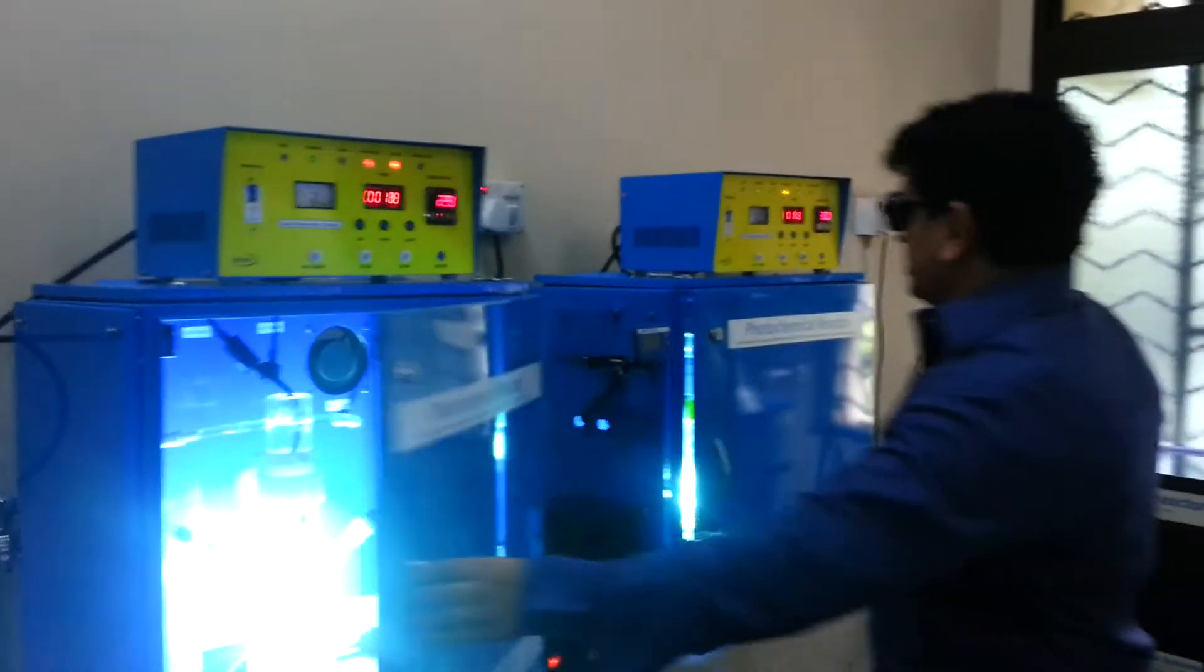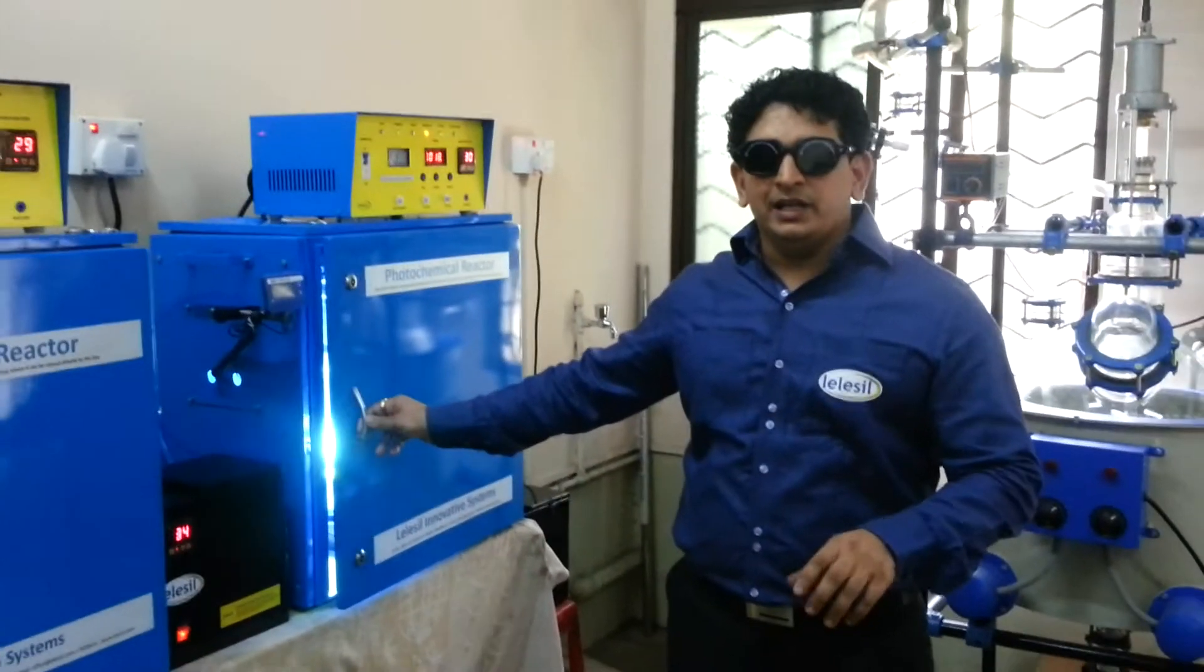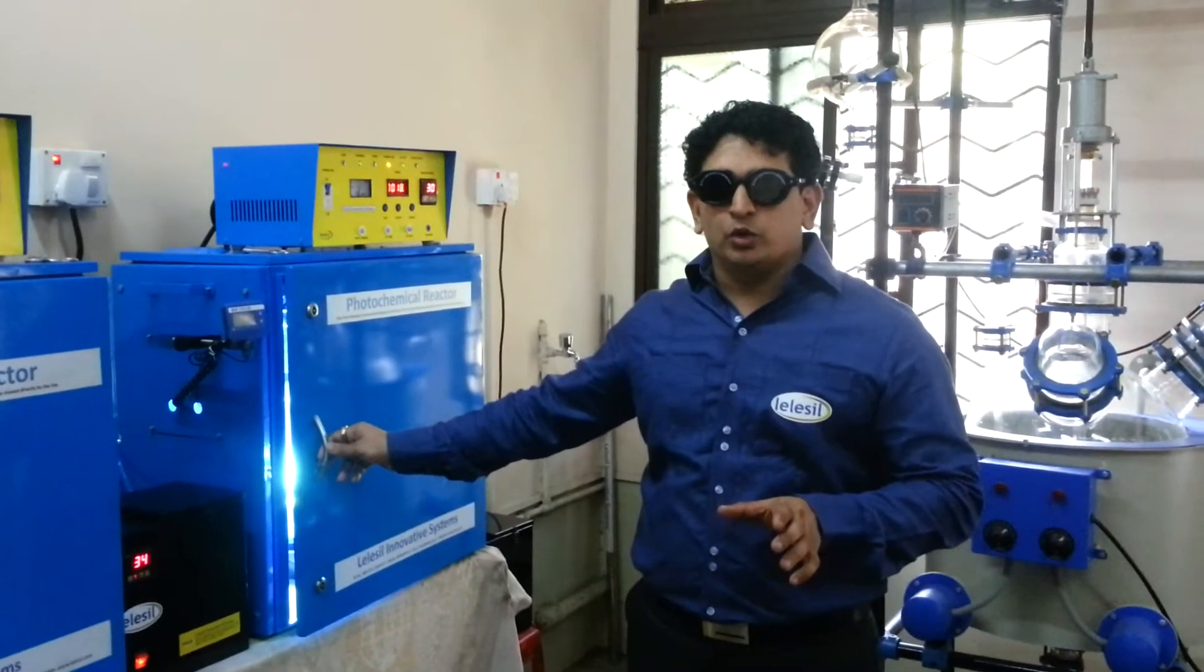This is a similar system having a heating plate so that the material could be heated as well as UV reaction could be carried out.